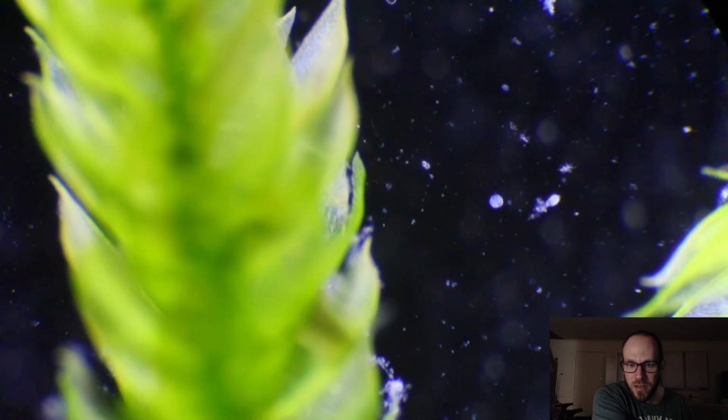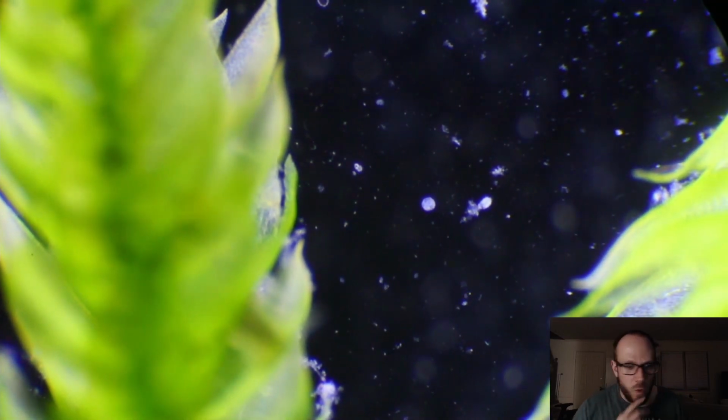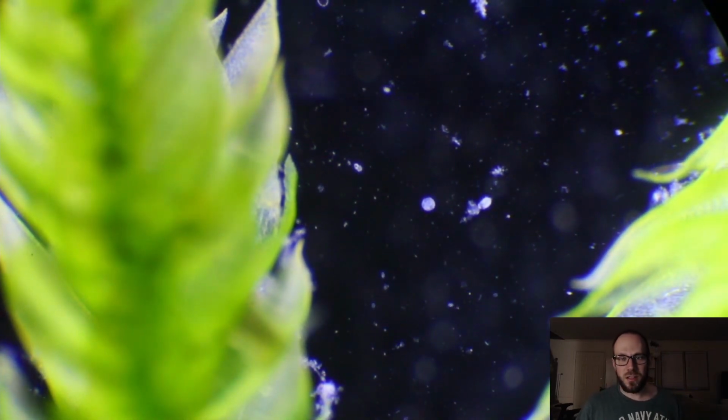Okay, what else we got here? That's a giant orb of something. Just, like, look at this. Just stuff swimming around everywhere. It's like a whole society that has no conception of me. But I see it. And I judge it. Yup.